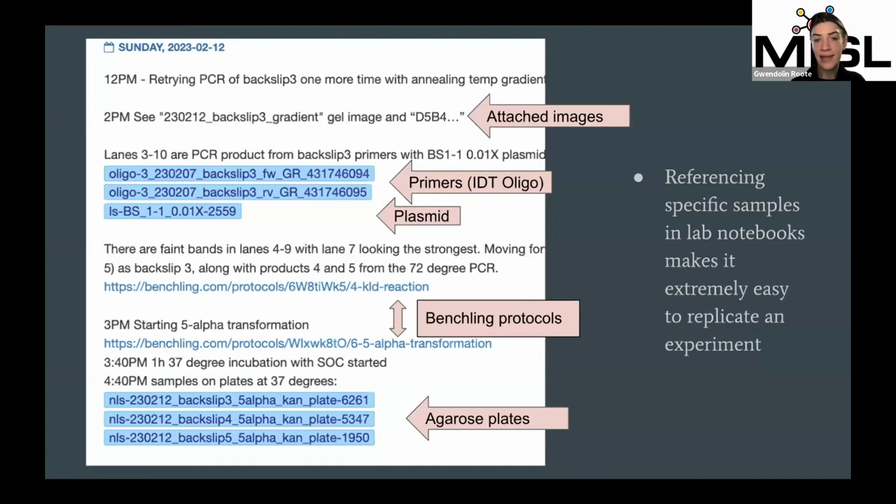We can also add things like general links to tools like Benchling, and then the sample types, obviously you can make it however you want. So we have liquid and non-liquid samples, plates, organisms, whatever we need.